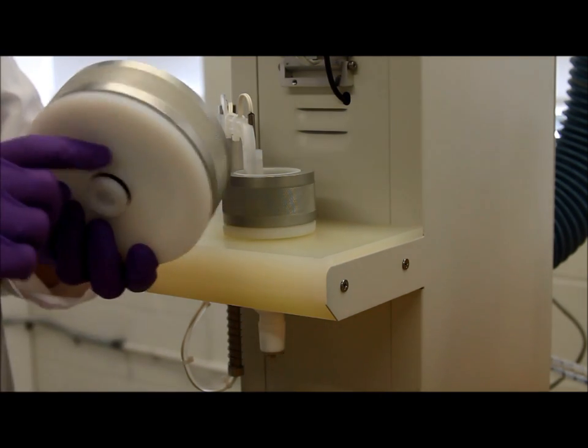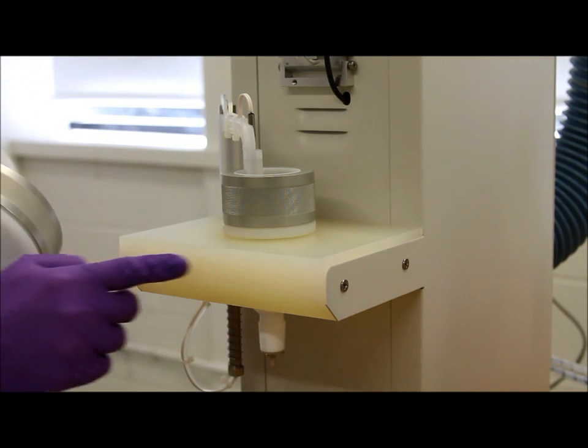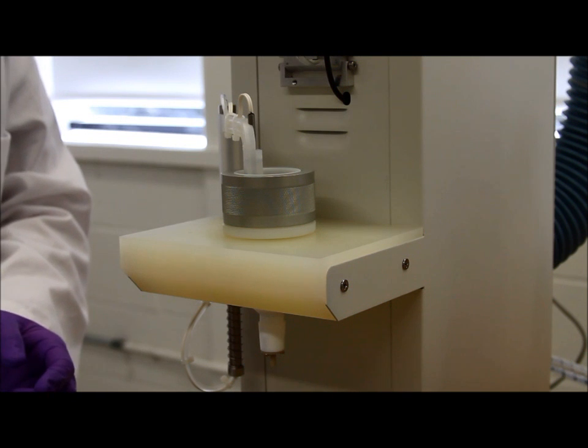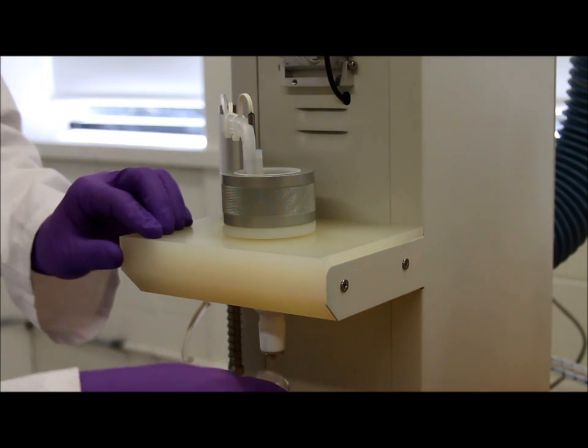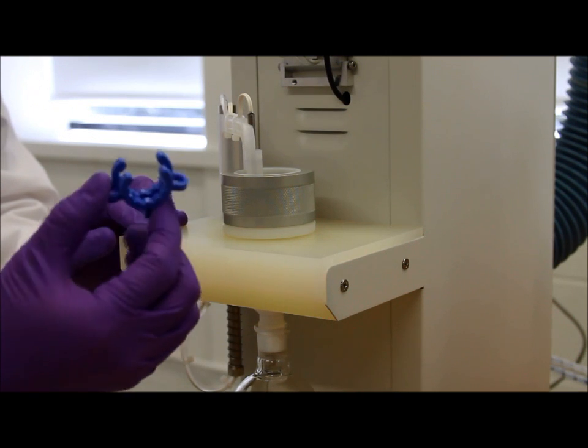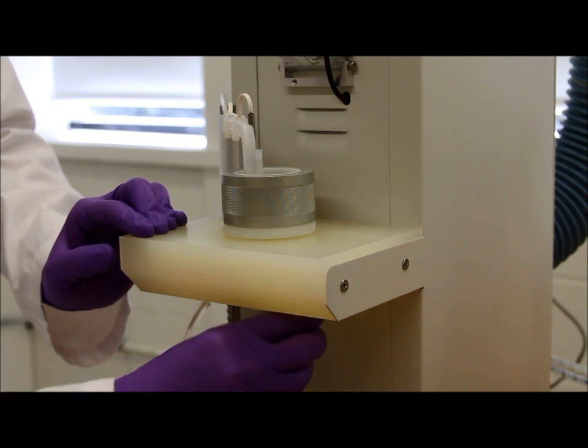Each disc holder has a gasket that forms a seal with your disc holding platform. Then grab your collection vessel and place it underneath and twist tightly. Then grab your blue clip and secure your collection vessel.